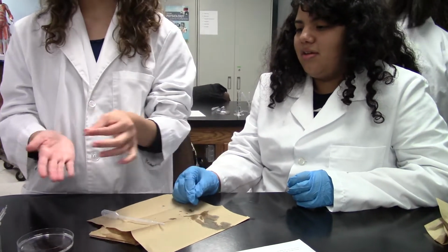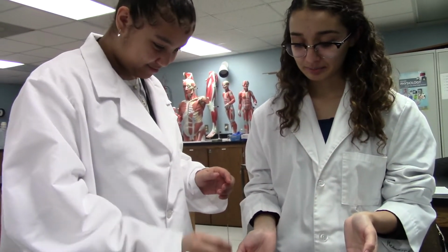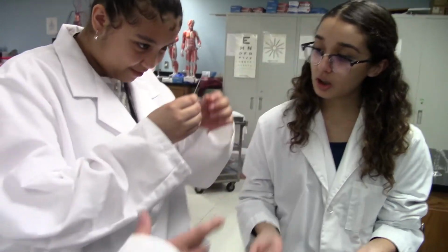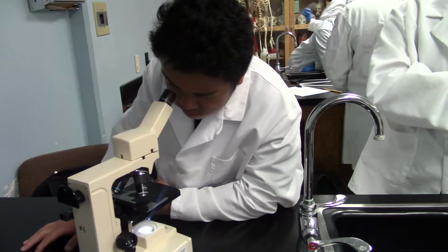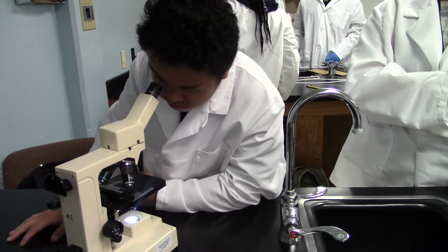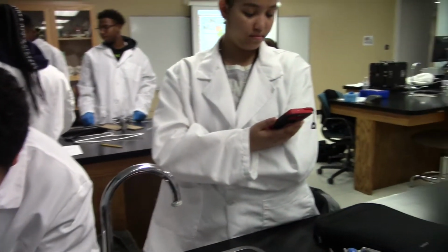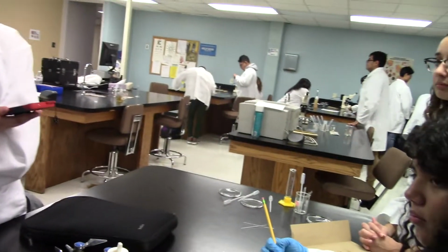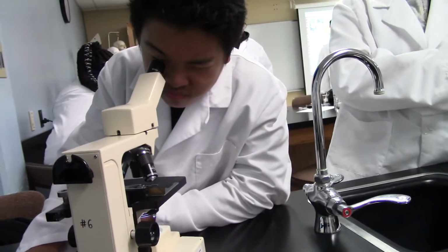Okay, who wants to go? You know how to do the microscope thing. Kind of. Okay. Oh, it's there. There you go. Use your pipette to push him. Here, push him down. Ready? Oh, 60 seconds, right? Yep, you're on the 60-second one. That's okay, they're wiggly jiggly. So it takes a minute. There is no rush. We still got plenty of time.